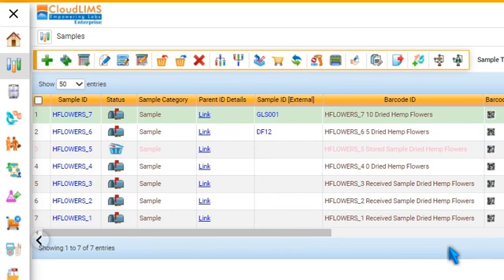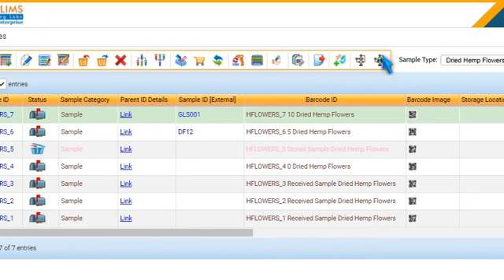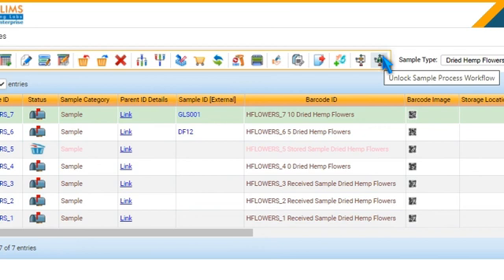To unlock, select the sample and click Unlock Sample Process Workflow. You can now make the required changes to it.